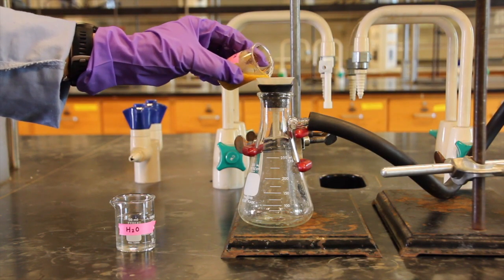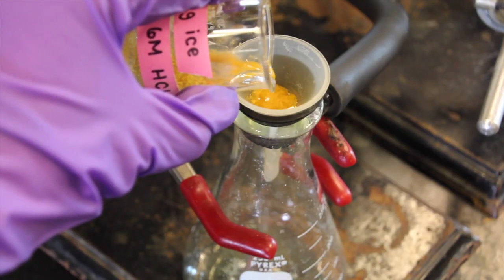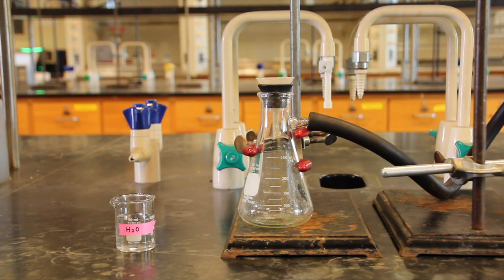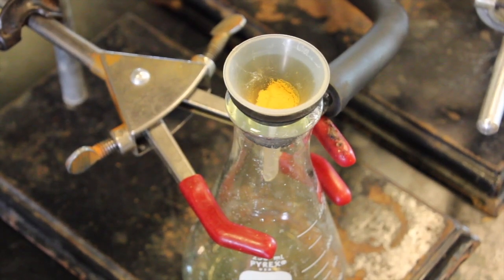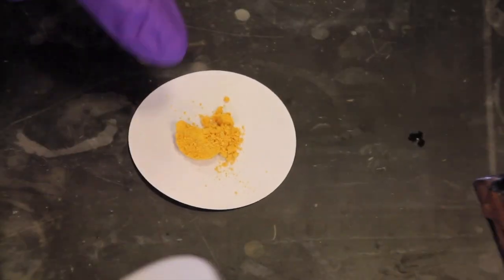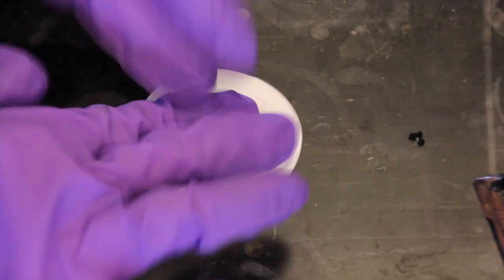Next, vacuum filter the orange ferrocene crystals using a Hirsch funnel and wash the crystals well with water. Remove the crystals from the funnel and press them between two sheets of filter paper in order to further dry them.